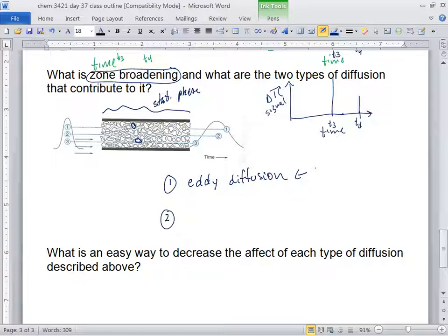Right? There's different paths through the stationary phase. So even though it's all A molecules, for example, the column did its job, but the point is these different A molecules are traveling different paths, all in the same column. And that's hard to stop. It's really hard to stop. But you fork out big money to try to stop it. And we'll talk about later on how they're trying to figure this out and how they're improving matters.